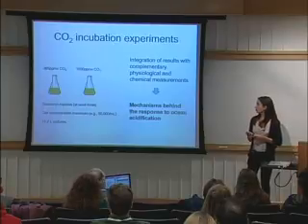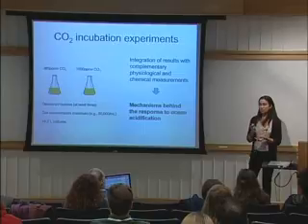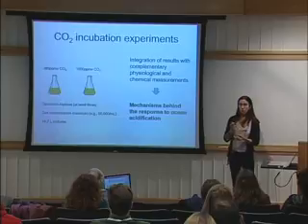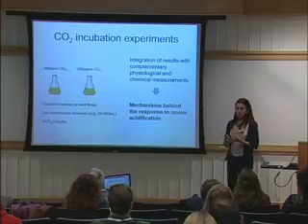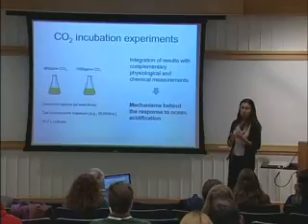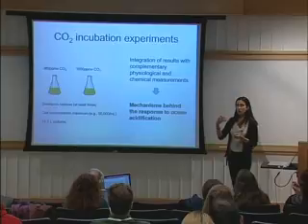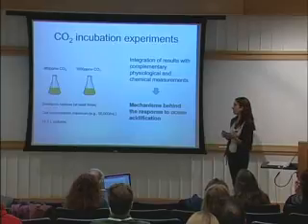And think about the fact that you need to look at your physiological data in conjunction with the chemistry. So you need to think about your blanks and your controls, and when you have to sample. You need to sample at time 0, before you inoculate the cells, and you need to keep your control without the cells and sample there as well to see how that has changed.